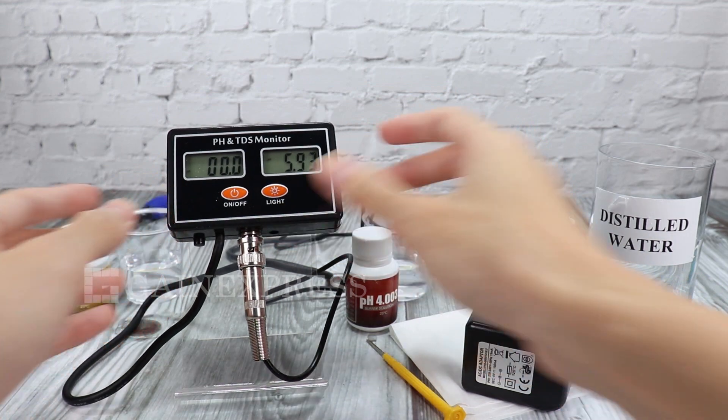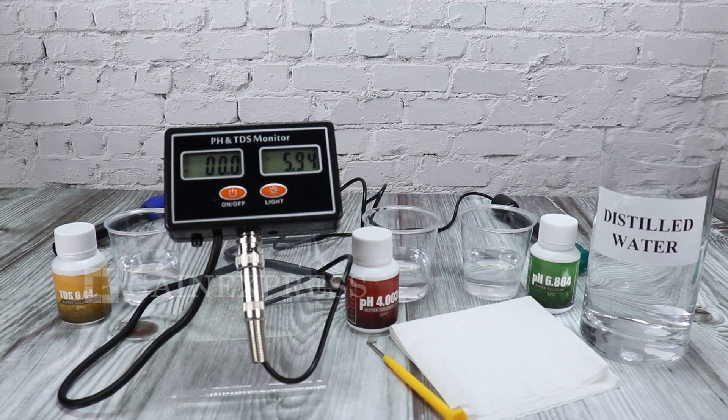This is a rechargeable meter and when the battery symbol appears, connect to the power adapter immediately.